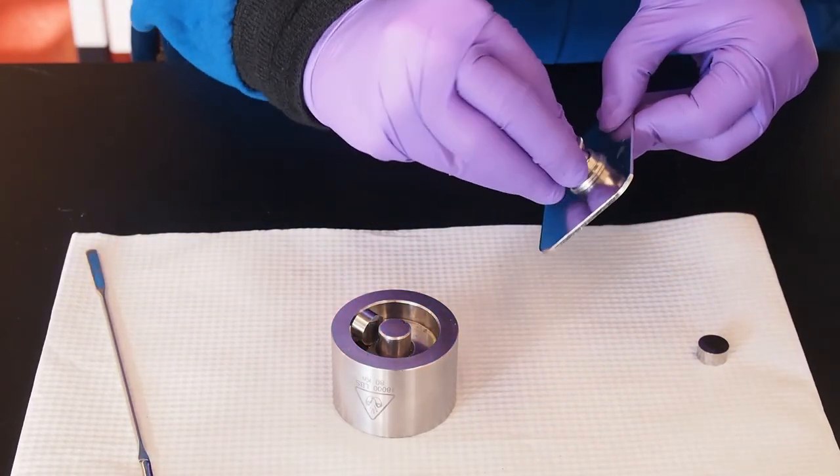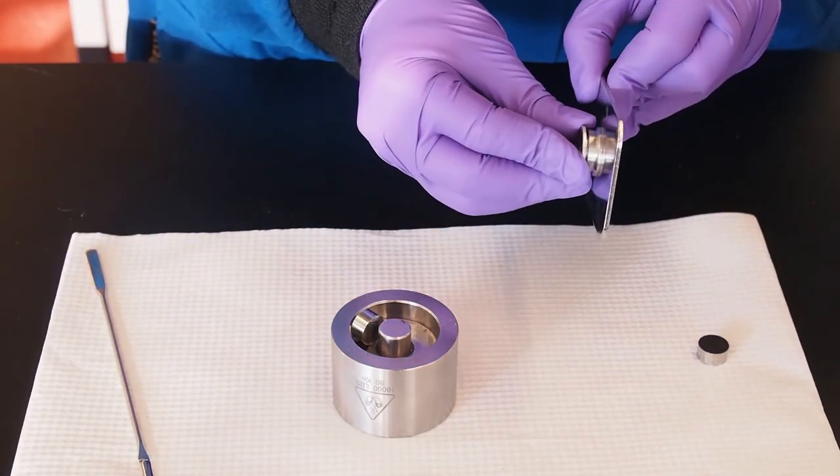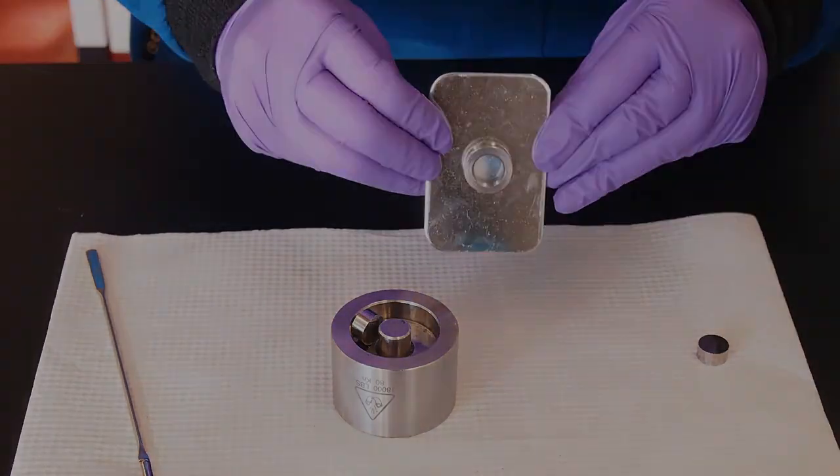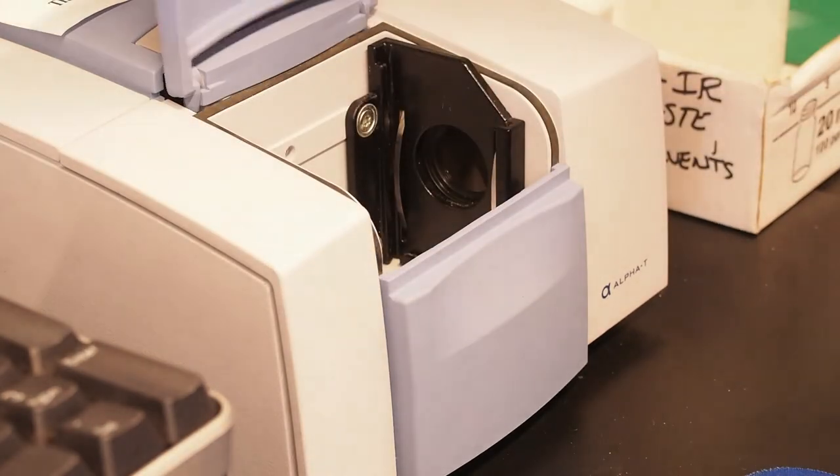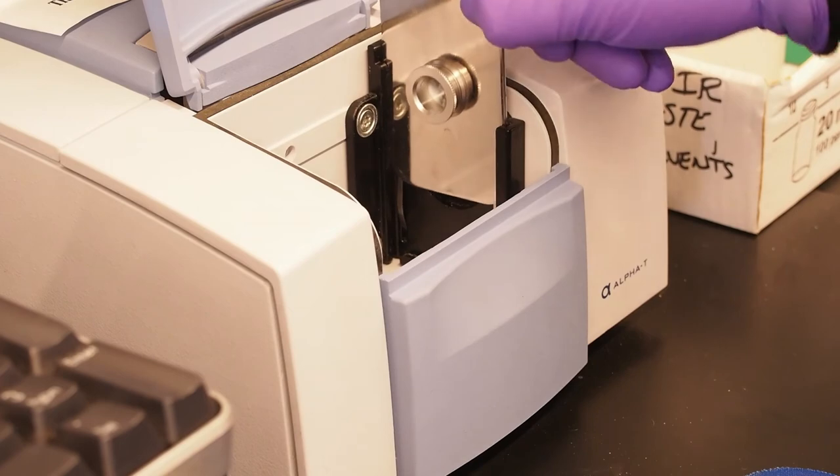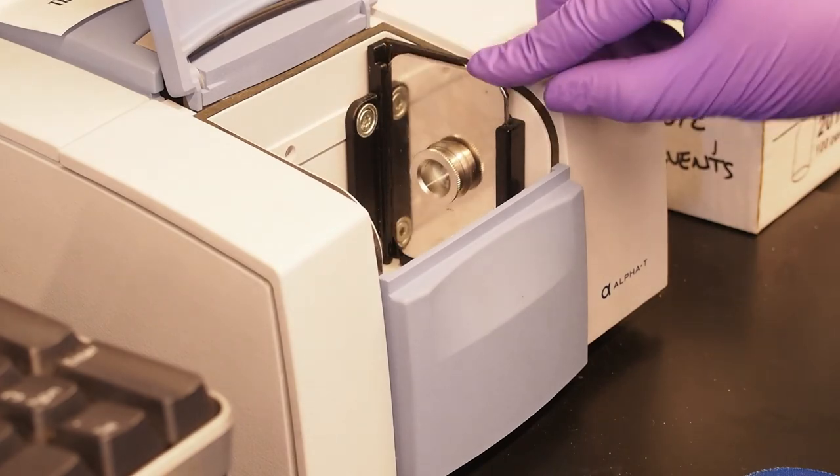Close the holder and take the assembly to the IR spectrometer which should be set up with the transmission accessory. Carefully insert the pellet holder into the transmission sample slot. You are now ready to analyze your sample.